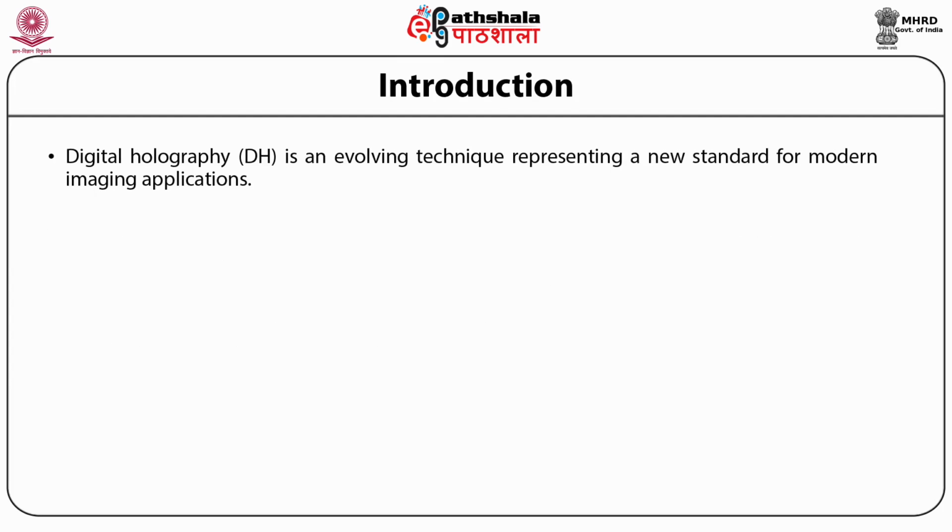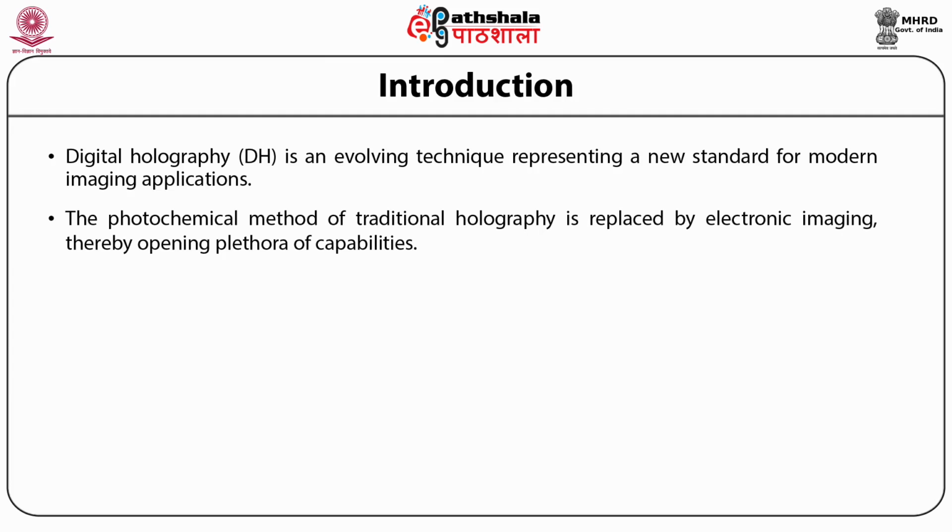Digital holography is an evolving technique representing a new standard for modern imaging applications. The photochemical method of traditional holography is replaced by electronic imaging, thereby opening a plethora of capabilities.